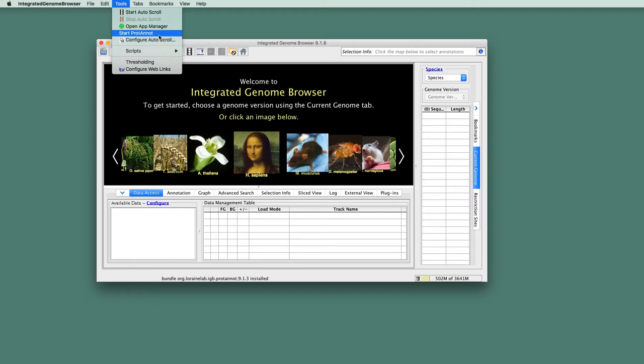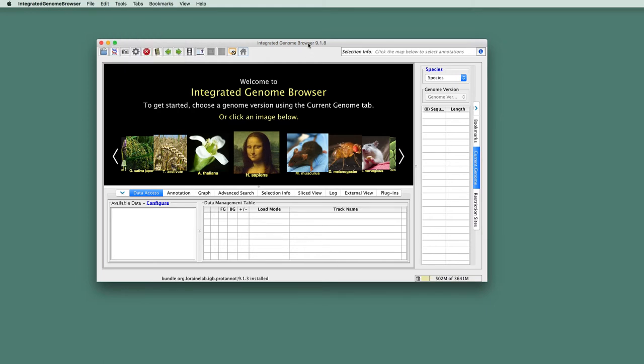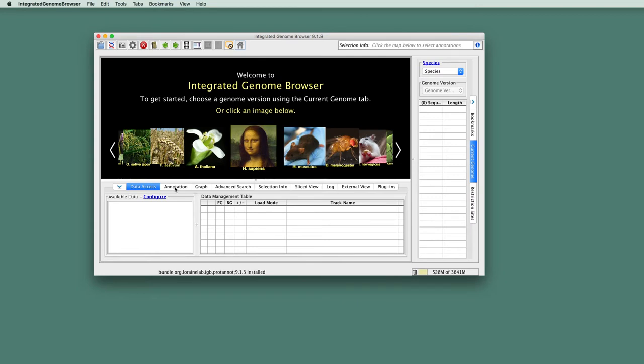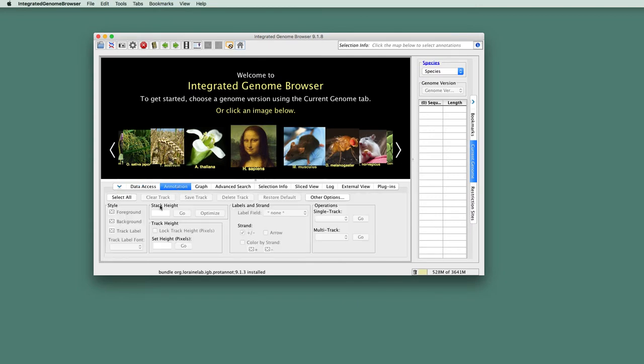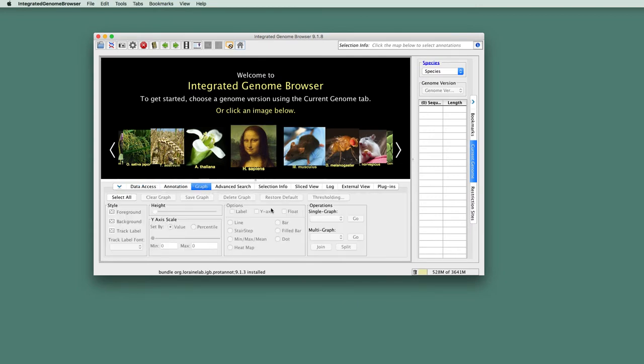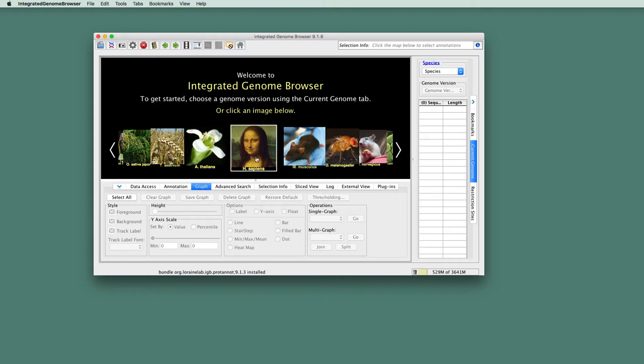Different apps will change the interface in different ways. Most of them will add a new menu to the Tools menu. Others will add new functionality to the Annotation tab or the Graph tab. There's a lot of different types of things that can be done.